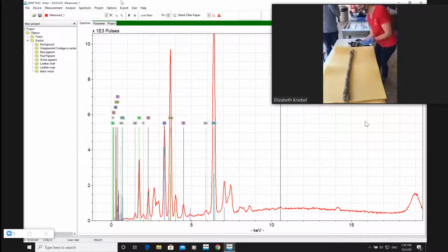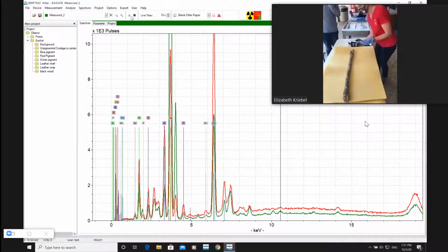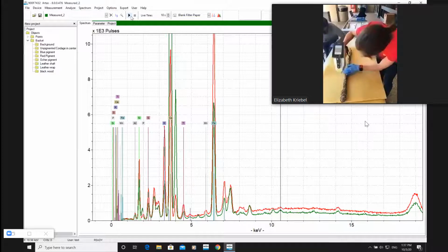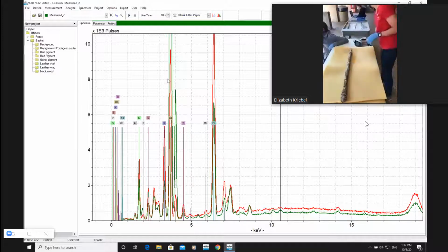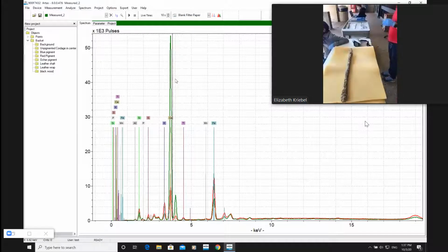Okay. All right, are you ready? Ready. Starting. And we're testing a pigment? The clay. The clay. Okay. No, that's not what I thought it was going to be. All right, got it. So in green here is the pigmented section. A ton of calcium. This is a plaster. And it's got some iron mixed in with it, so I'm guessing a little bit of iron in the plaster gives it that yellowish hue.